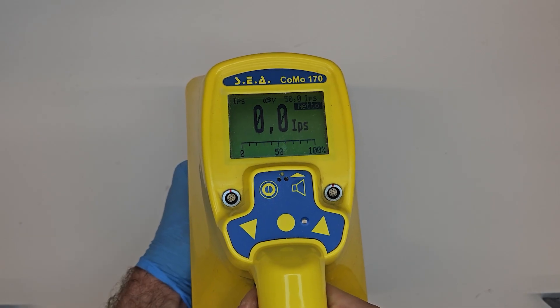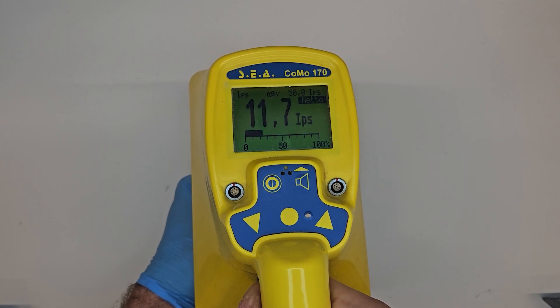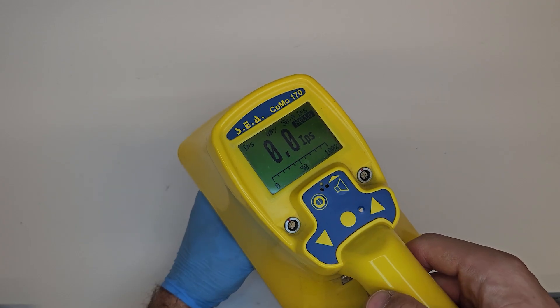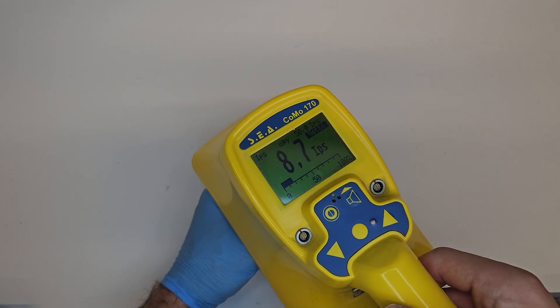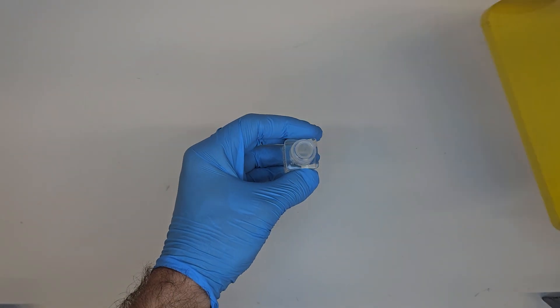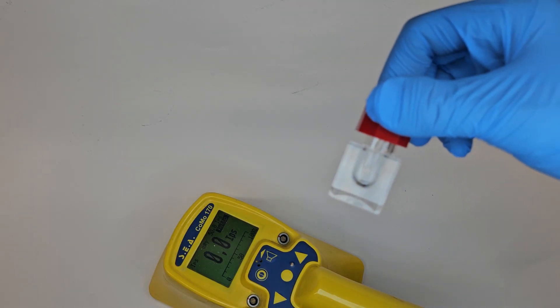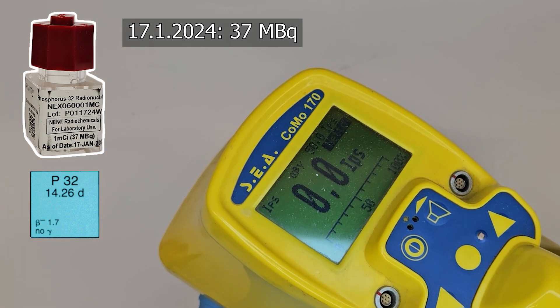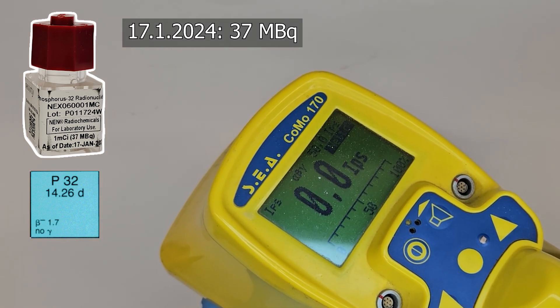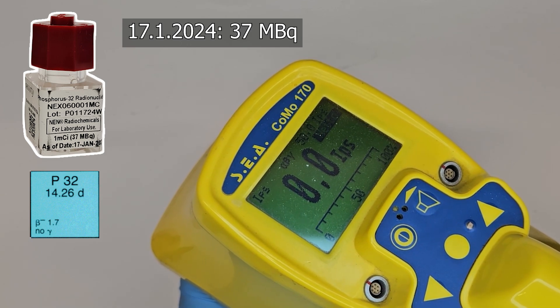Samples 1, 2, and 3 are sulfur-35 solutions, and sample 4 is a supposedly dead phosphorus-32 solution — this was from the radioactive flower video. We can clearly measure values from the sulfur-35 solutions. As of recording, today is July 22nd, 2024. The phosphorus-32 solution is from the 17th of January 2024, so about six months ago.